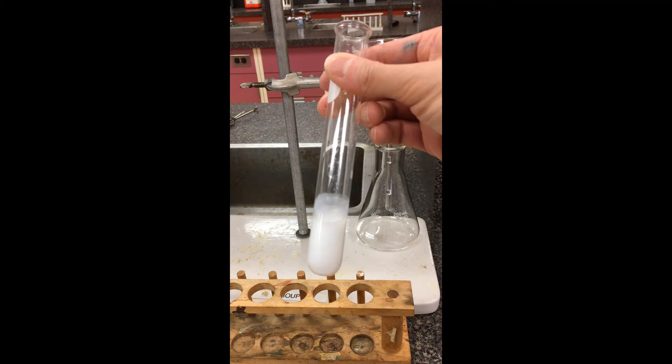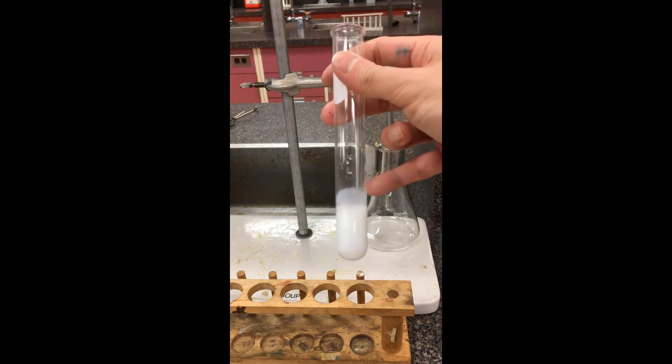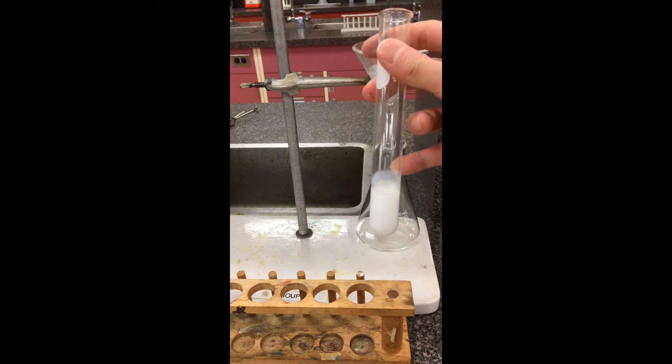Let's say I want to separate this by filtration. So the solid is definitely going to be too large to pass through the filter paper. The water in the background here should be able to get through no problem.